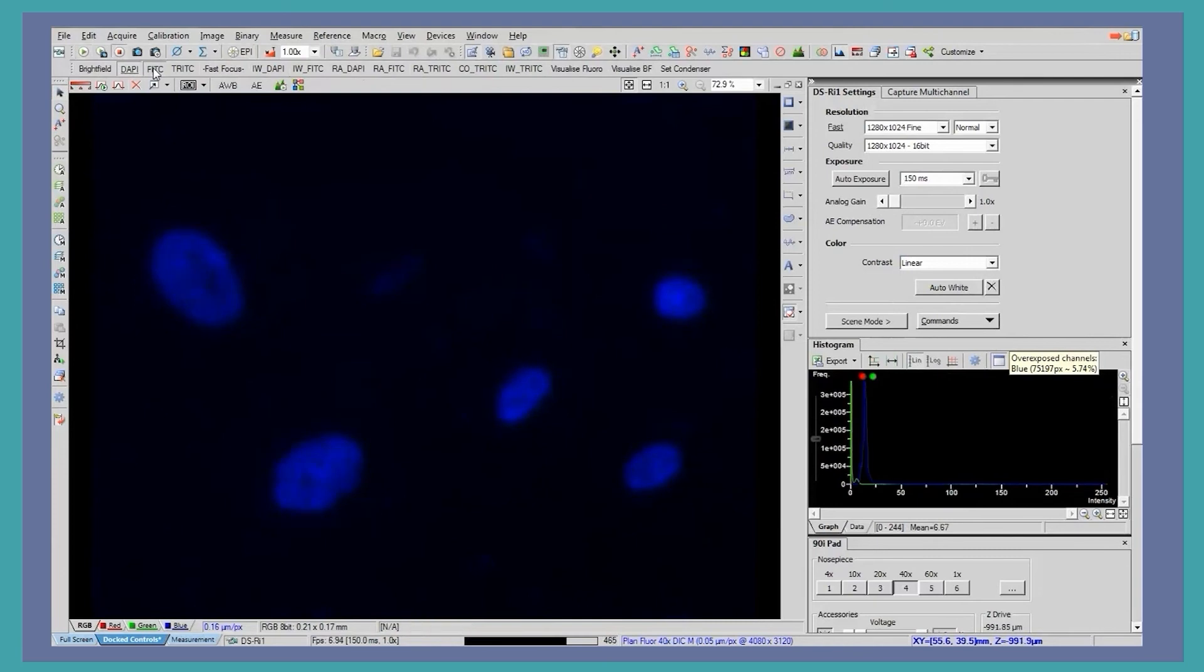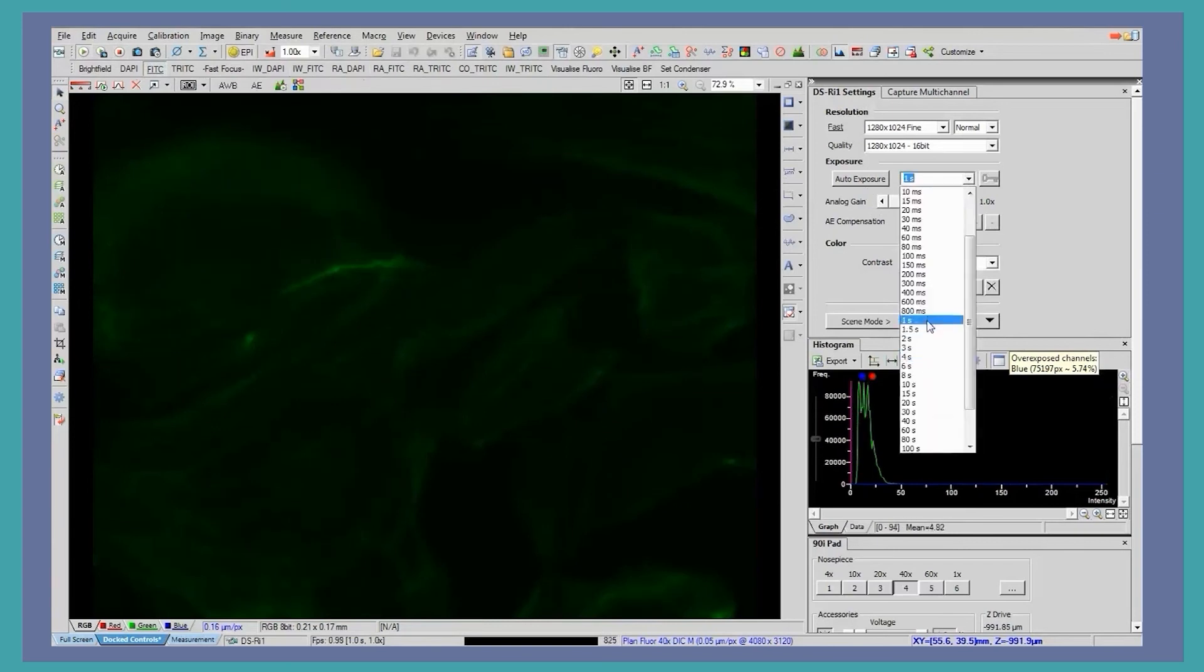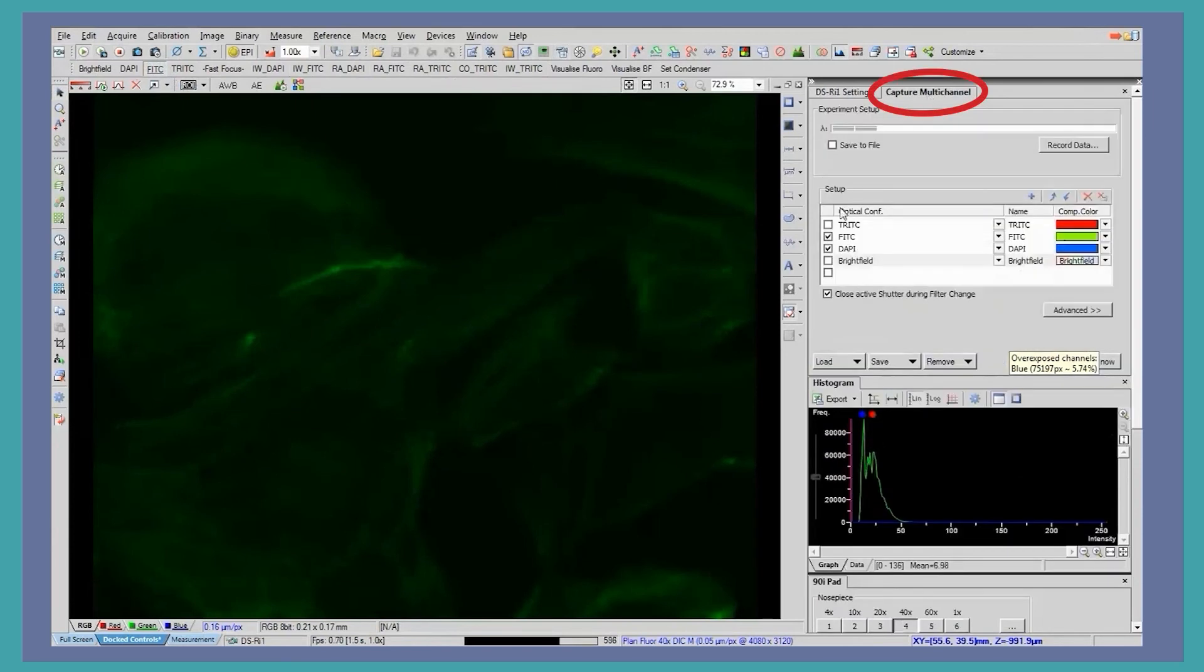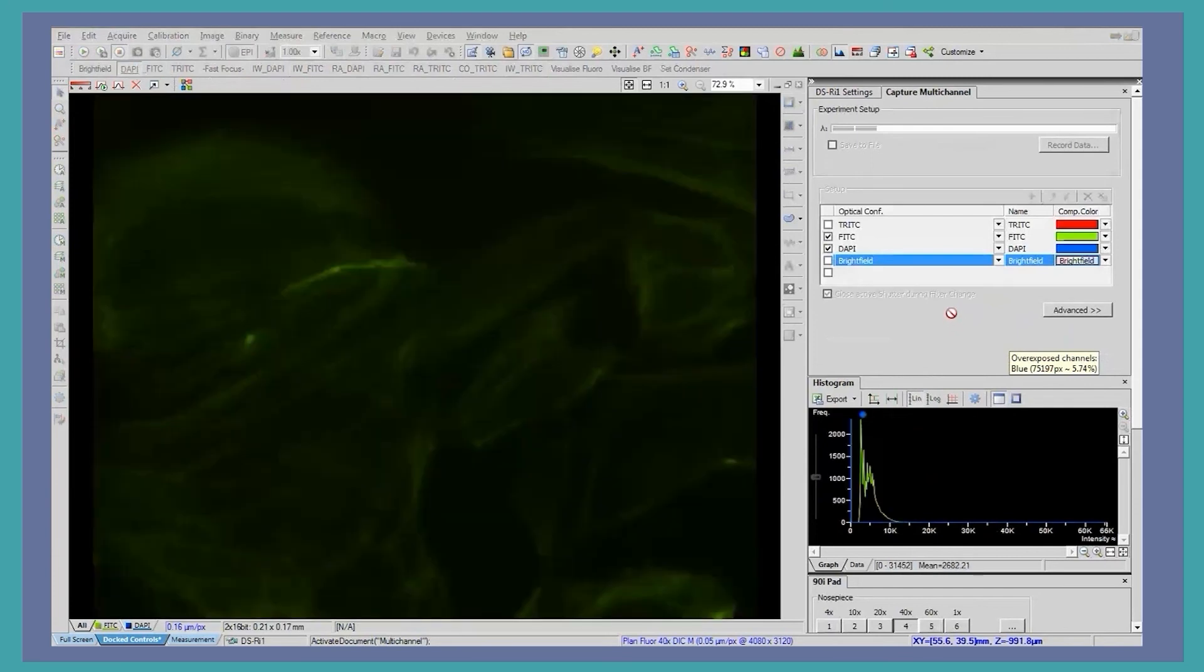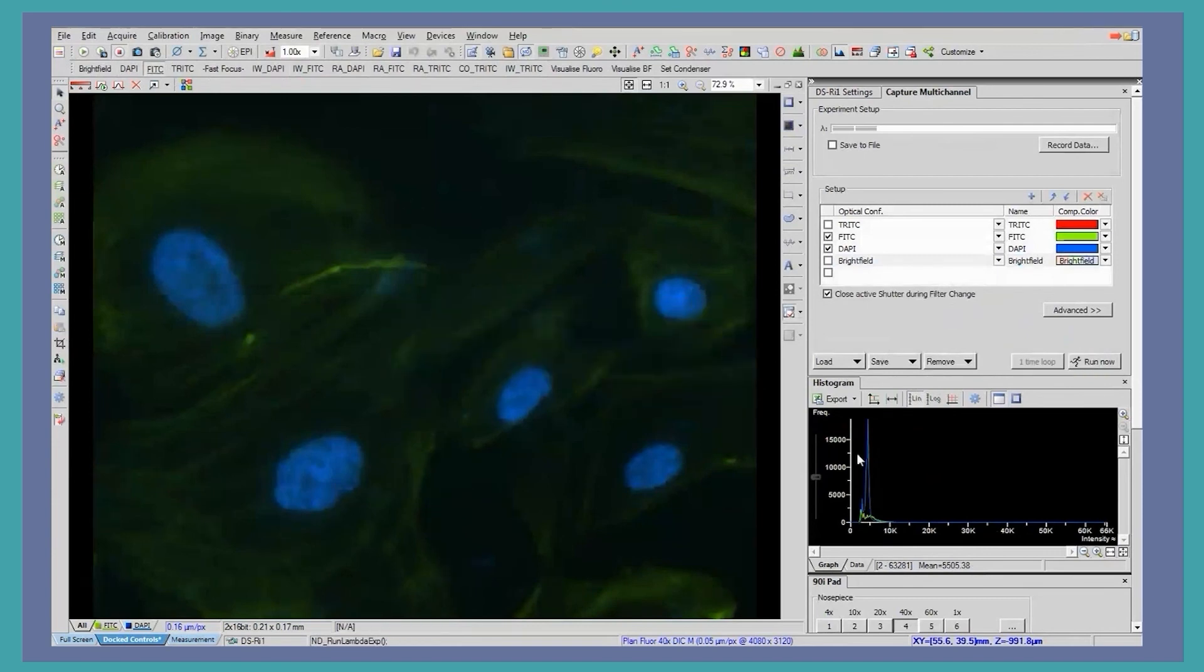This is FITC staining for the actin cytoskeleton of meningeal cells. Here we again adjust the exposure in a similar way where we can just see sharp detail into our image. We now select on the image interface that each channel lines up with its corresponding color that we have selected. We can then run and capture this image. During this process, the microscope will filter through the different filter blocks and acquire an image through each one that is selected. The image is then overlaid and saved, and we can clearly see the nuclei and cytoskeleton of the cells that we have captured.